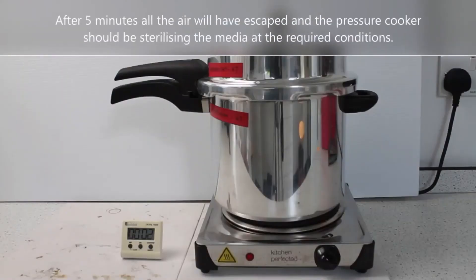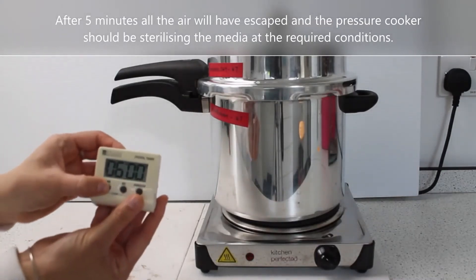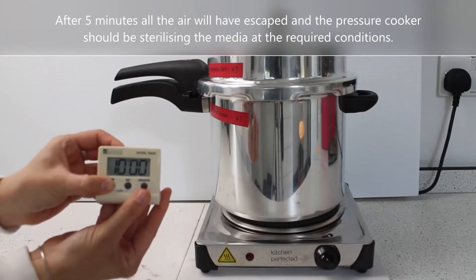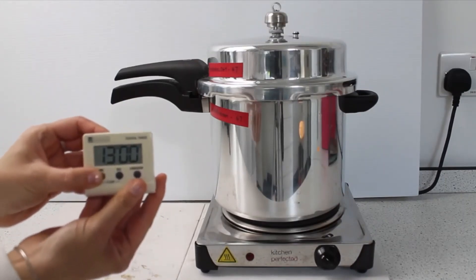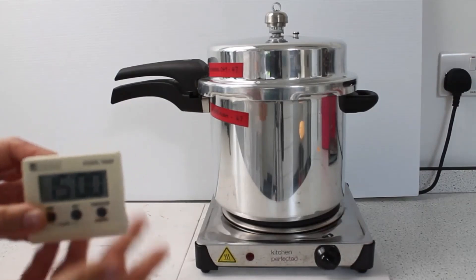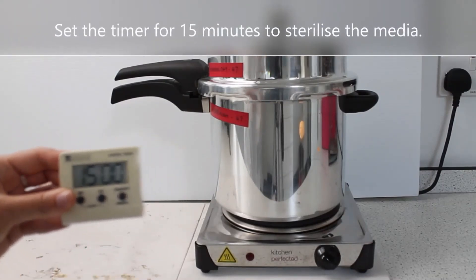After 5 minutes all the air will have escaped and the pressure cooker should be sterilising the media at the required conditions. Set the timer for 15 minutes to sterilise the media.